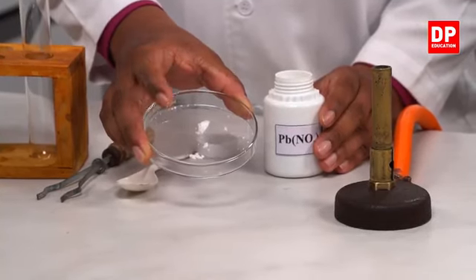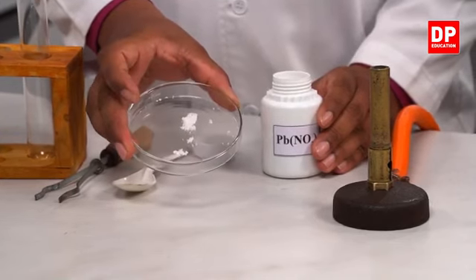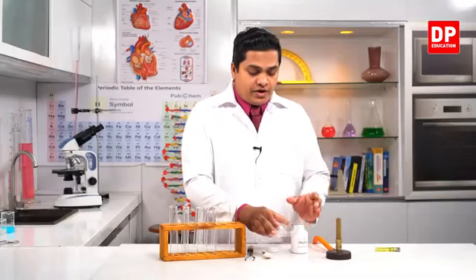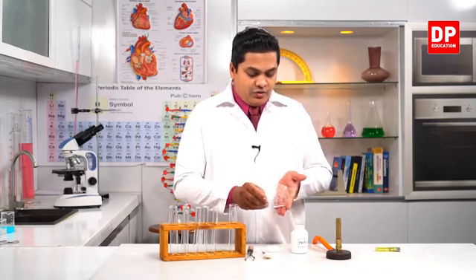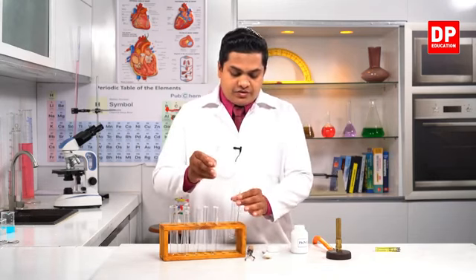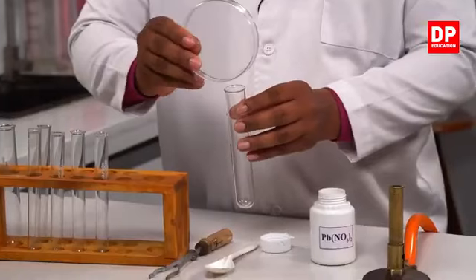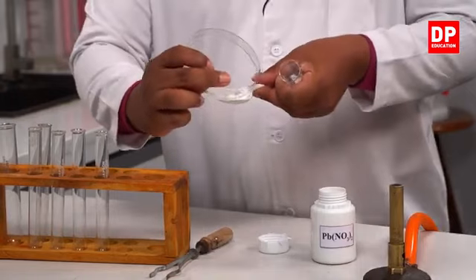This is the nature of lead nitrate. See, it's like salt, lead nitrate, right? So now I'm going to add this lead nitrate into my boiling tube and heat it to see what the observations are. So I'll put this into the spoon.